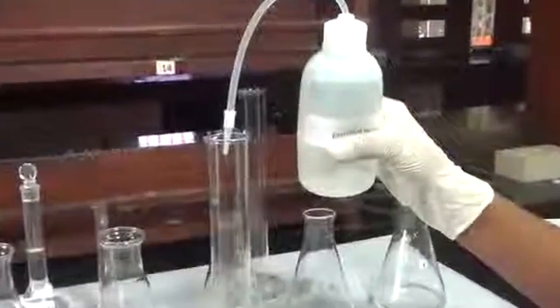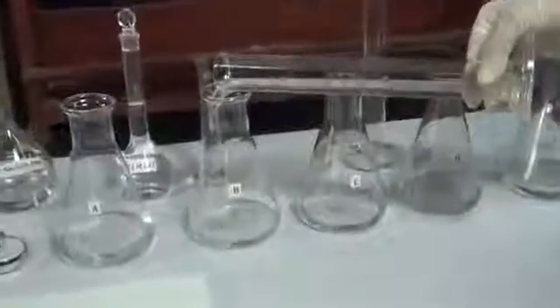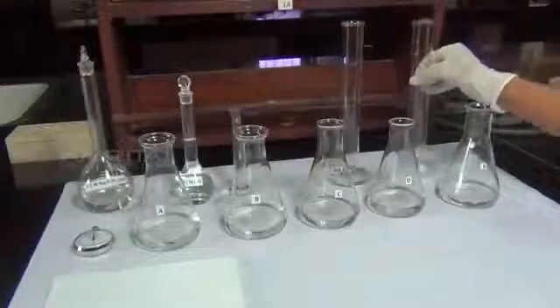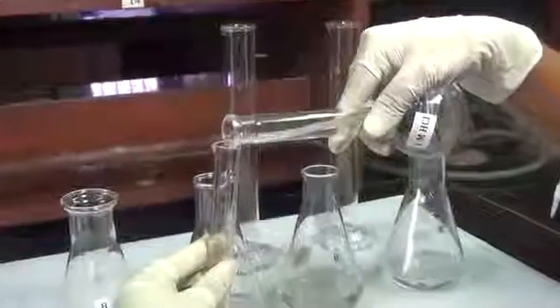Then add 40 ml of distilled water to flask A, 30 ml to B, 20 ml to C and 10 ml to D, so that the volume of solution in each flask is 50 ml. Take 10 ml of 1 molar hydrochloric acid in the measuring jar.